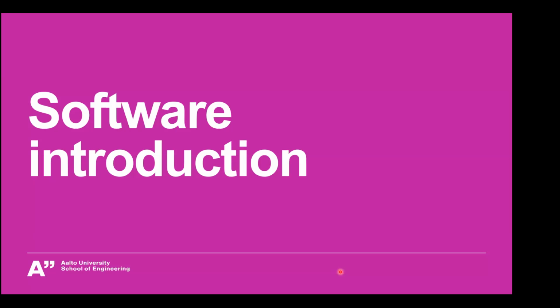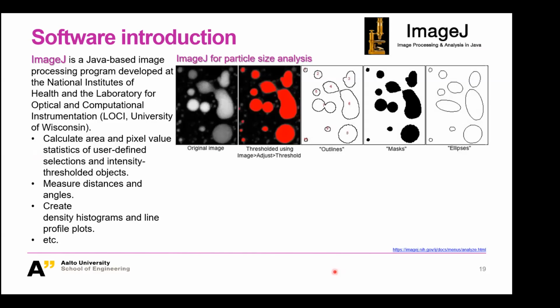Then we can go on for the second part, the software introduction. The first software is ImageJ, which is what I want to show you here. It is a simple and powerful method to analyze your LOM and SEM figures.